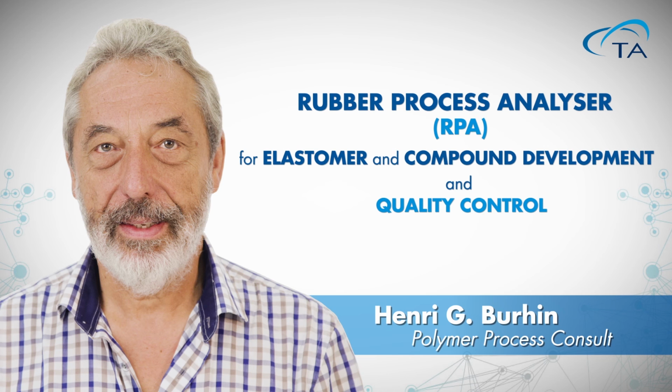All right, Henri, we have questions coming in. Our first question is about tan delta, and the question is, since tan delta is a ratio, would it not be better to look individually at G prime and G double prime behavior to understand the polymers?